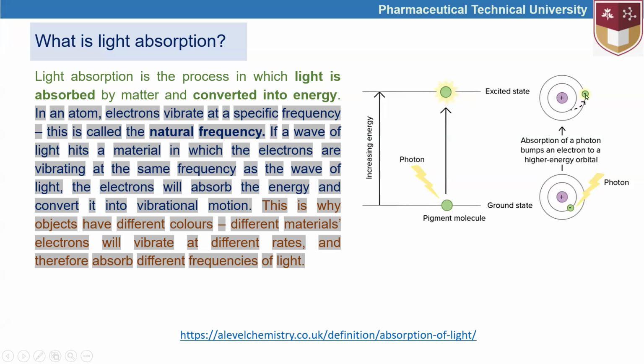At this state, electrons cannot be held long, and they tend to return to their ground state. When they return, some of the energy that was absorbed to jump will be released as well.